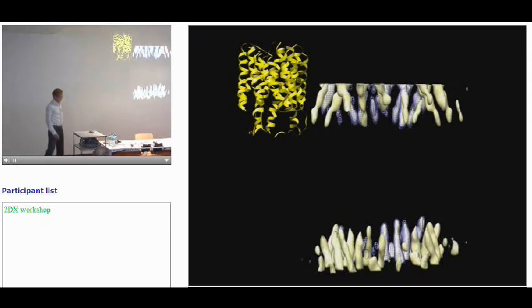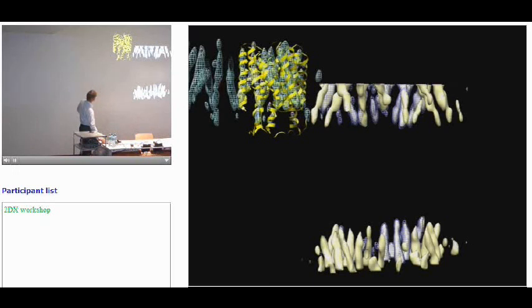So you can manipulate your maps and expand them to cover the whole unit cell. The next thing is to shift the origin so that the map really covers the model which you're interested in.